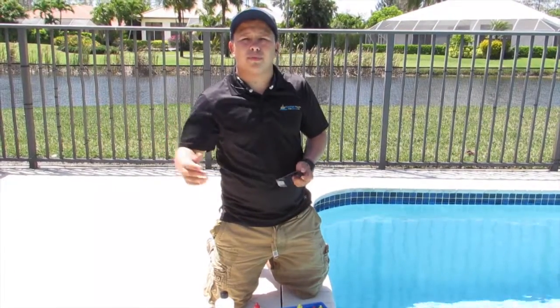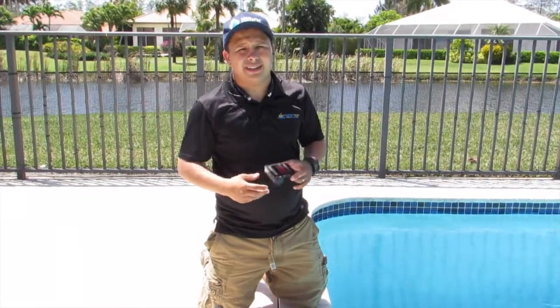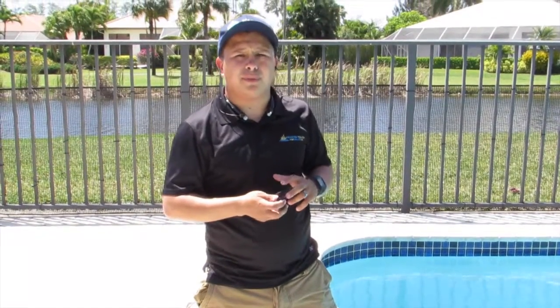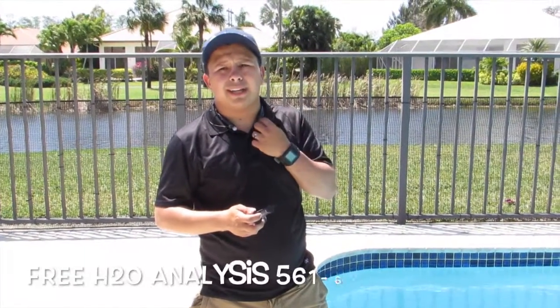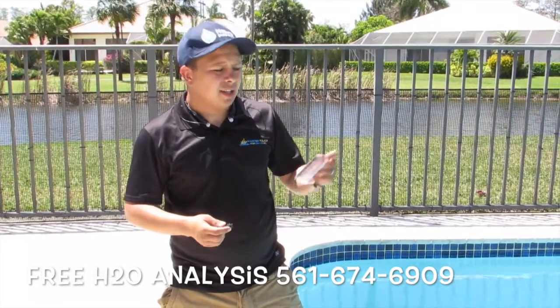Instead of actually going to a pool store and having them test your water — usually they're a sales company, just trying to load your pool with a bunch of chemicals that you might not even need. I'm just teaching you how to do the basics with the Taylor.